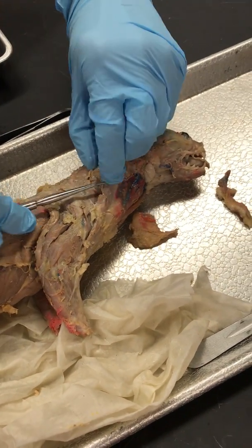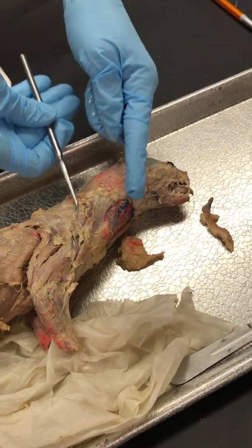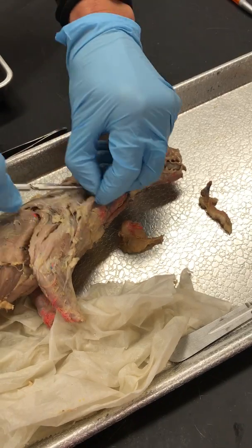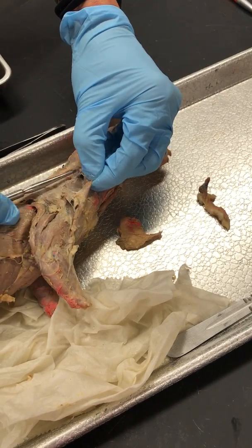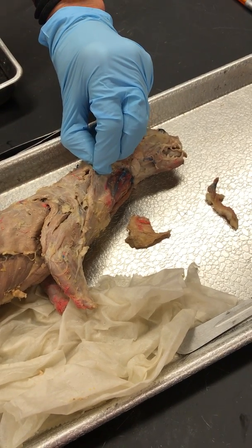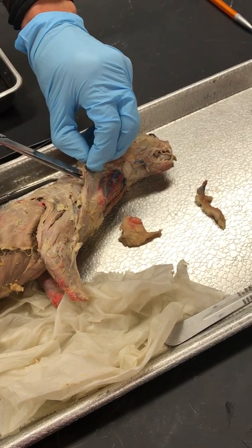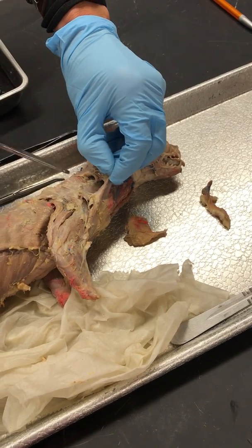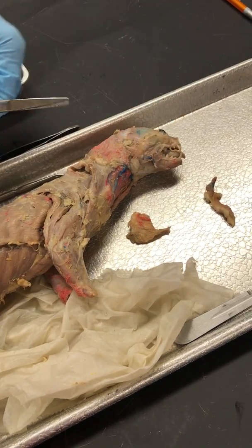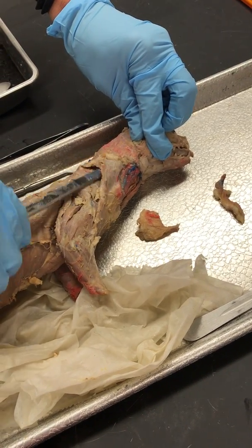It comes down from the Cleidocervicalis, which goes like that, and up under the Cleidocervicalis. Cleidocervicalis basically goes all the way up to Temporalis, so it's a pretty big, pretty thin muscle.